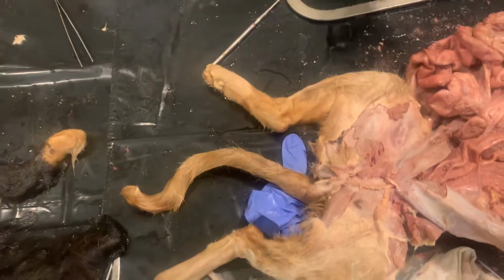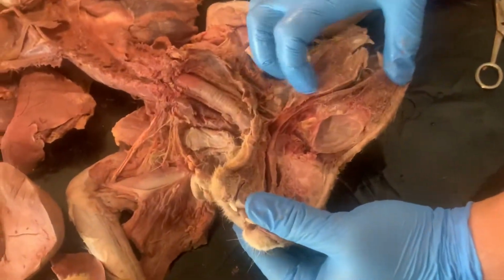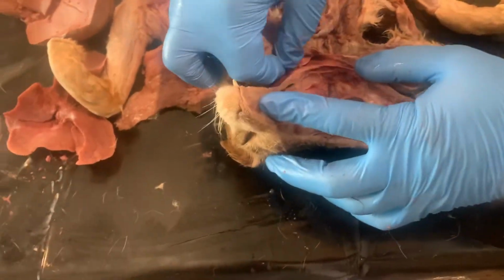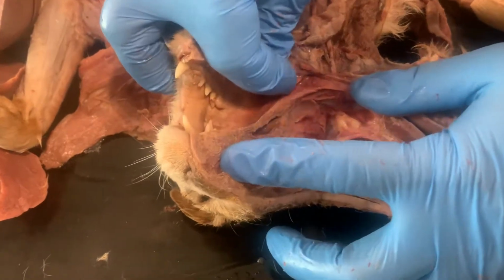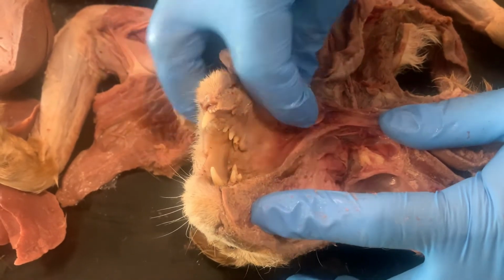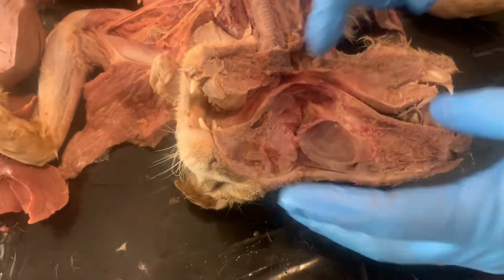All right, so while we're on this cat, let's look at our bisected head here. So you have a head bisection. You have your cerebrum, your cerebellum. Then down here going down into the throat, this is the epiglottis. Epiglottis is what's going to cover up your trachea, which makes it so when you swallow, food goes down your esophagus and not your windpipe. So nice big tongue, epiglottis, cerebrum, cerebellum.